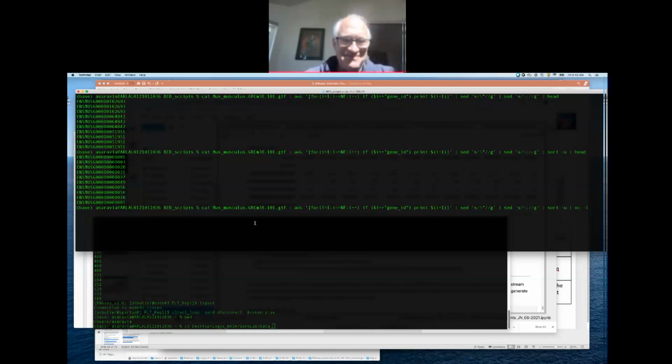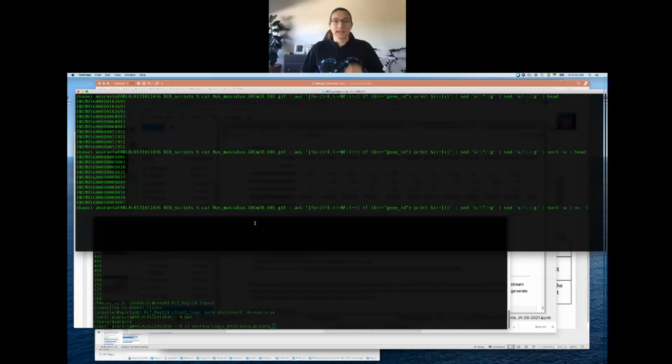Yeah, for sure. Thanks so much, Phil, for that additional explanation. And guys, I didn't know how to do this before last night when I Googled how do I pull the phrase that comes after a phrase that I know. Literally, that's what I Googled. How do I print a word after a known word in Unix? And that's how I found the command.